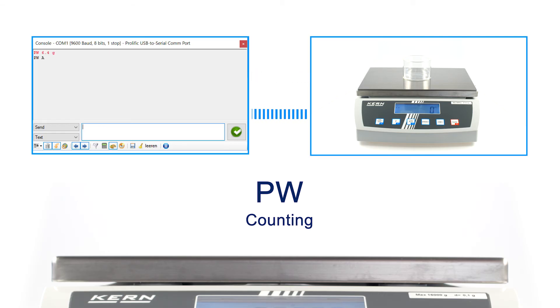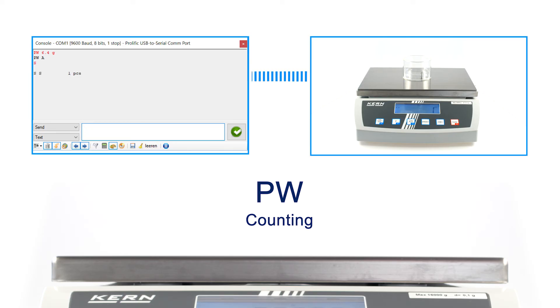Now you can place the objects for counting on the platform of the scale. Afterwards, you can send the command S to the scale. You will get the counted number back as an answer.